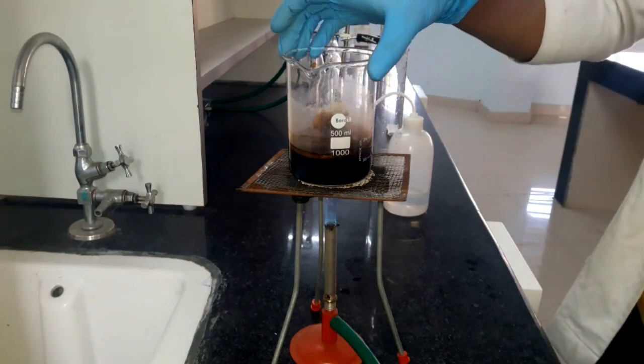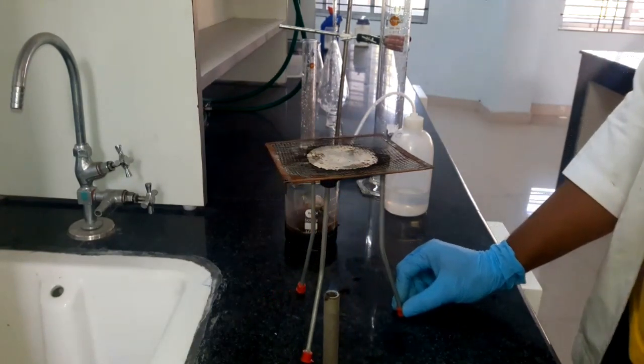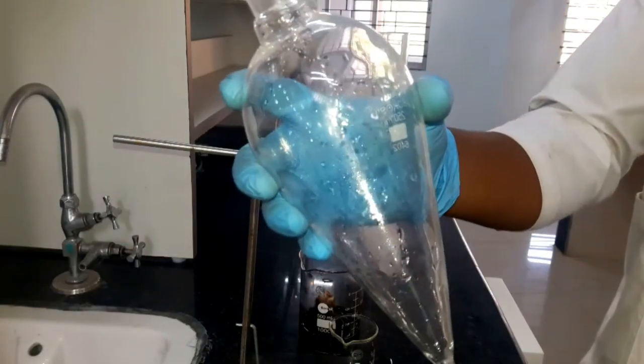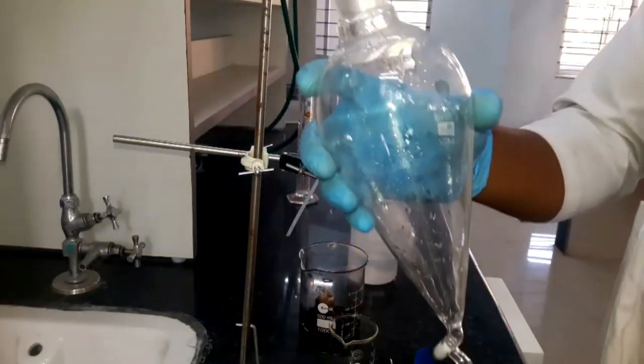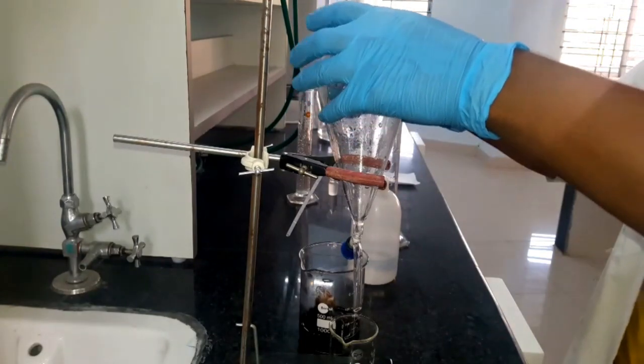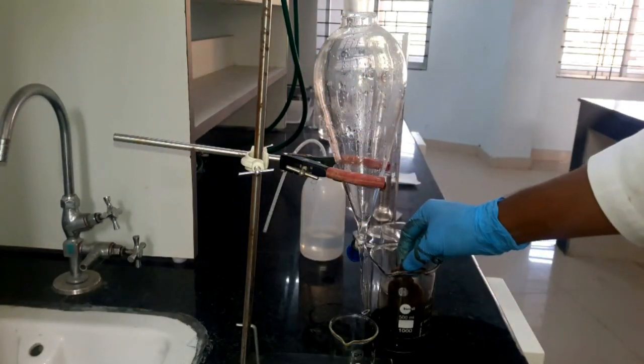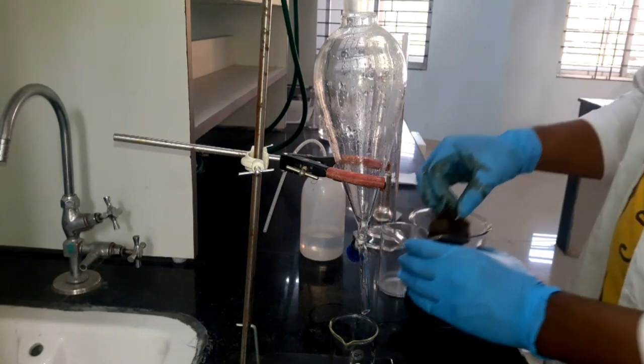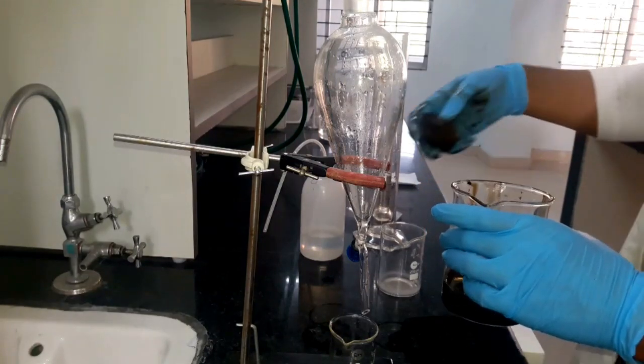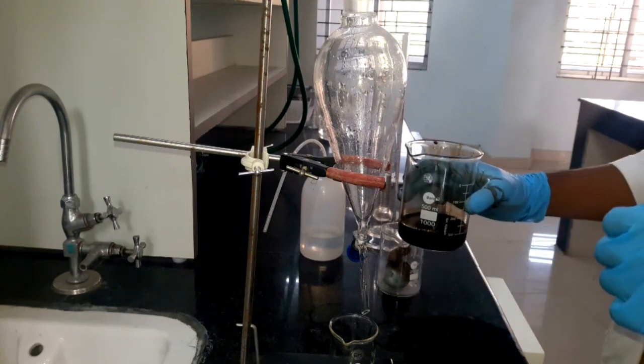Now we keep the solution for cooling. This is our 250 ml separating funnel - with the help of this apparatus we can separate the organic and aqueous layers. This is our cold solution, now the cold solution is mixed with 15 ml DCM.